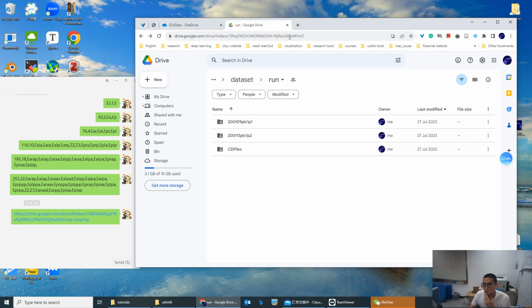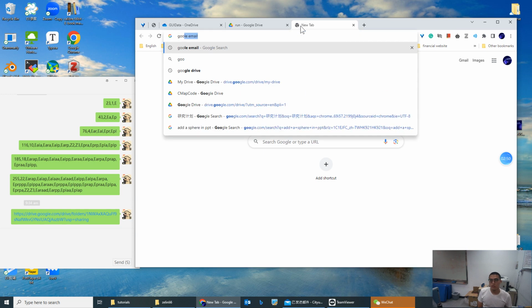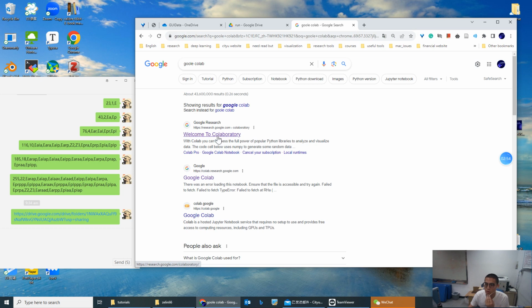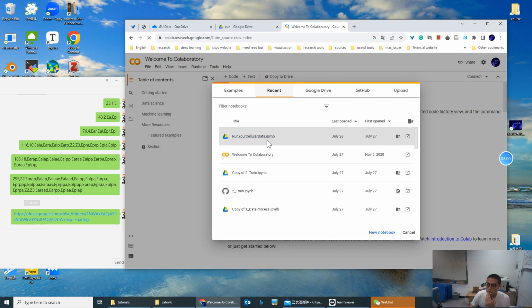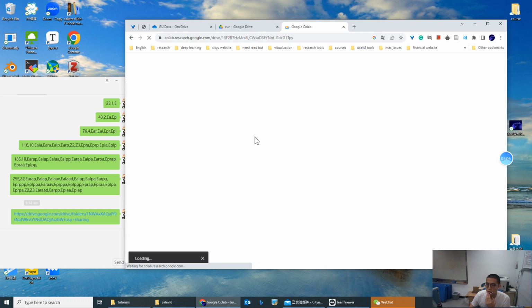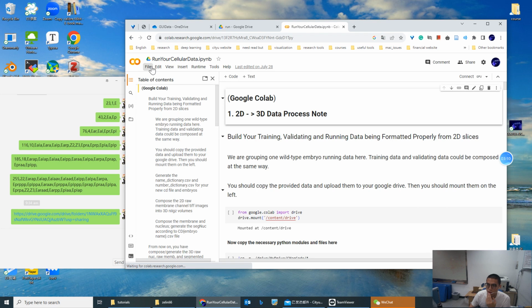you should go to Google Colab and open the Colab I give to you. Then you save the Colab to your Colab.